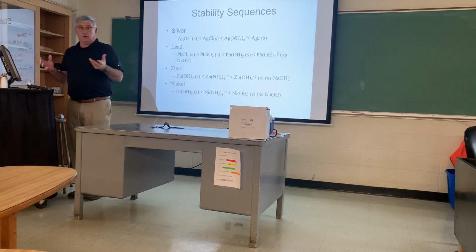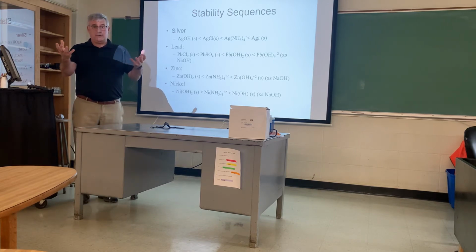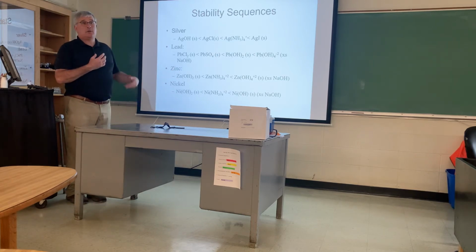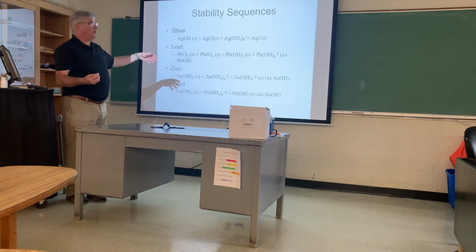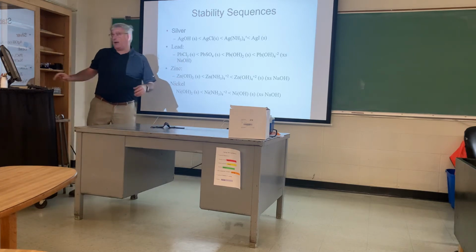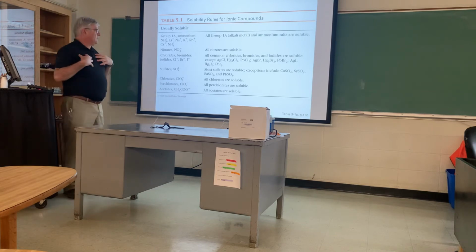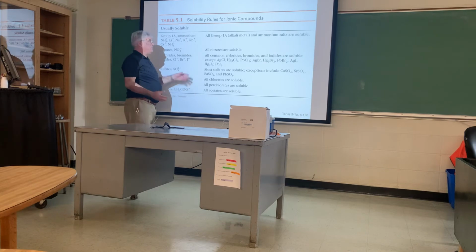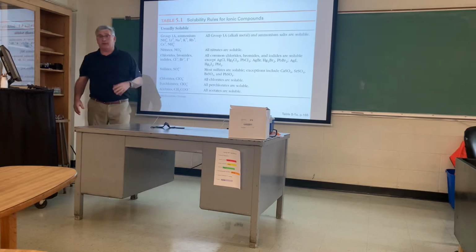So your goal really is to solve a puzzle. We're going to let you build your own key to the puzzle by doing reactions. You're going to know what they are, and then I'm going to give you unknowns, and you're going to use your key that you made to determine the identity of the unknown. So this is actually a really fun lab, in my opinion. Some helpful documents for you would be these next 2 pages, which are from chapter 5, the solubility rules.